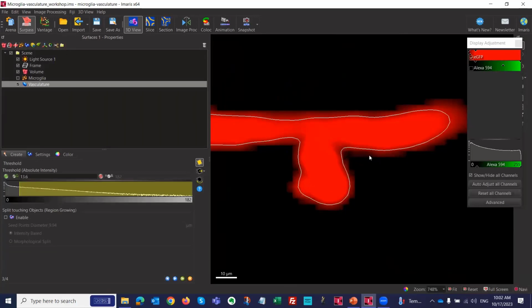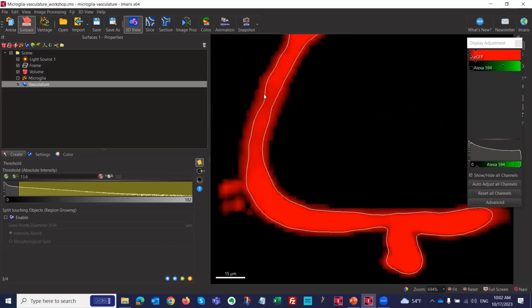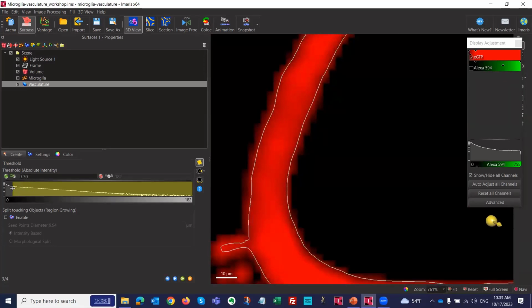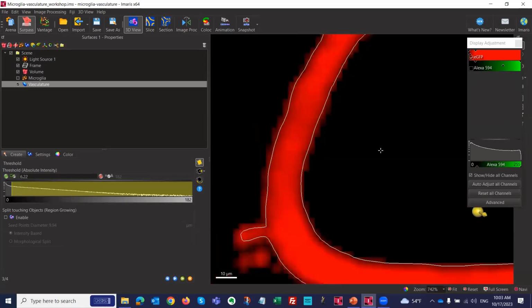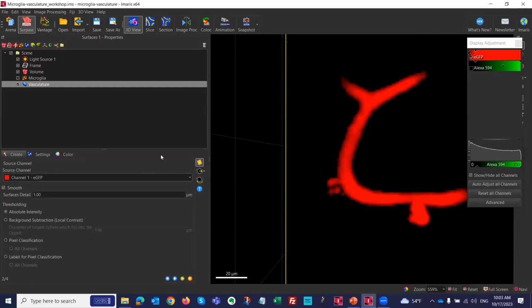here, you can already see it's much, much better. We did lose intensity here, so it's not good anymore. So we can drag the slider here and adjust it like this. I can do those things. But if you can, avoid dragging this as much, because this is where you include human bias, and you may be doing it a little bit differently than someone else. So I would rather click A again to go to automatic, and go back and try to change things.